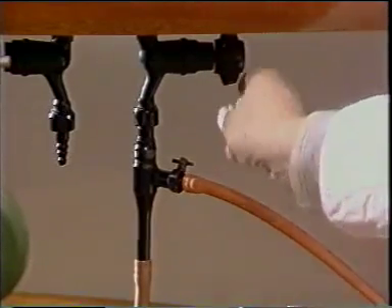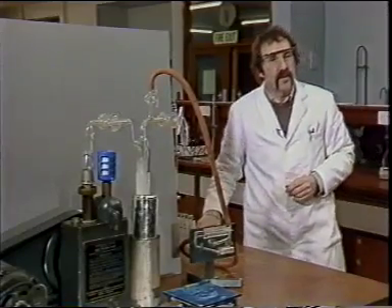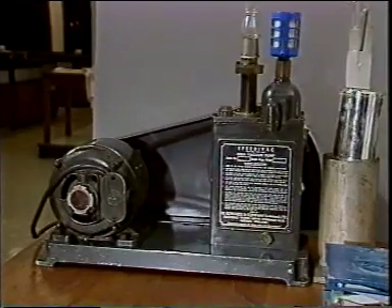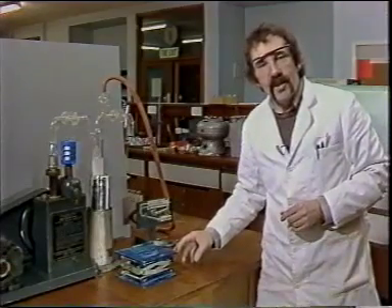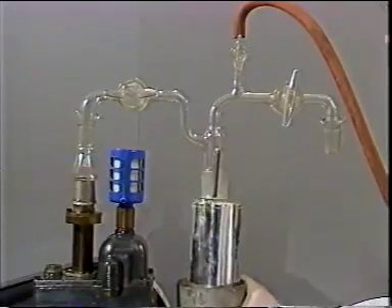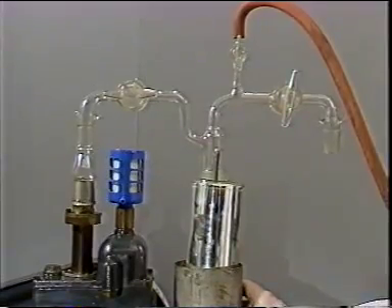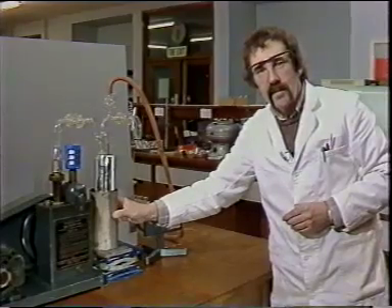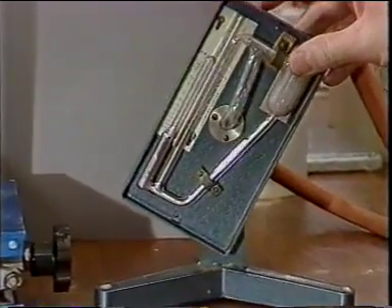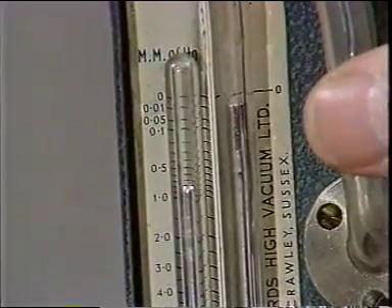A pump of this sort always has to be turned fully on when we're using it for distillation. If we need lower pressures than that, we have to use a rotary oil pump, and we have one here. In order to avoid contaminating the oil in the pump with organic vapours from our reaction, we need to intersperse a trap between the pump and the reaction vessel. This is filled with acetone and dry ice, which gives us a temperature low enough to freeze out the organic vapour. We measure the pressure on this McLeod gauge, and you can see it is recording a pressure well below one millimetre.